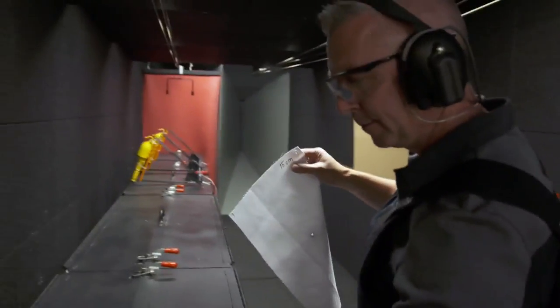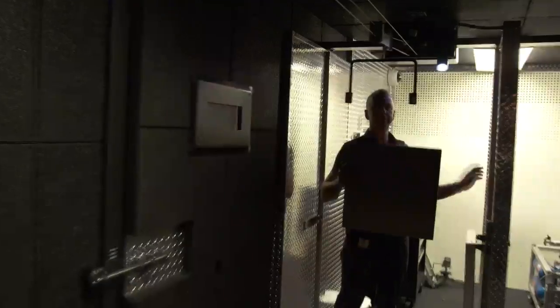Today I'm doing some work on a shooting case where a suspect gun was picked up. I'm going to determine how far away that gun was when somebody was shot and try to further the investigation and how we can get to the truth.